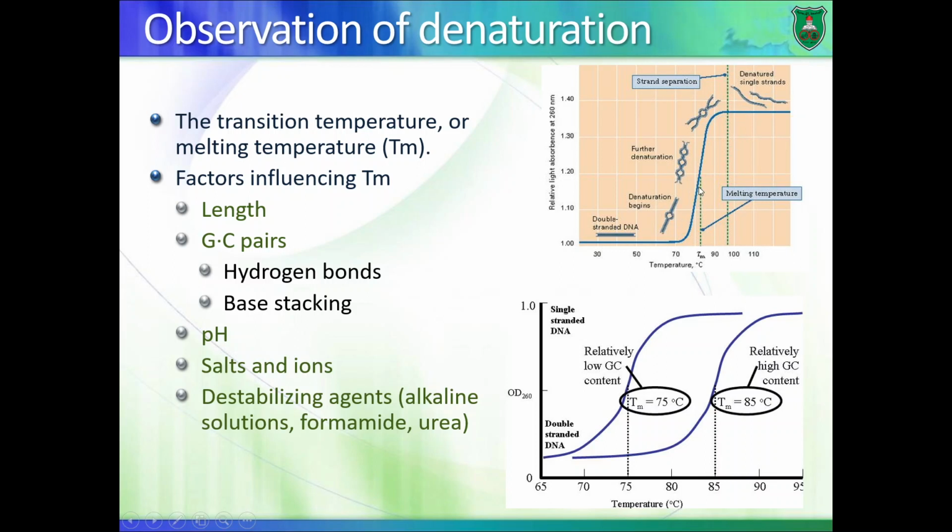Okay? Now, the point of 50% is very important. So this is 1.4, this is 1, the 50% mark is about 1.2. Now the 50% mark is very important in biochemistry, in molecular biology, in pharmacology.